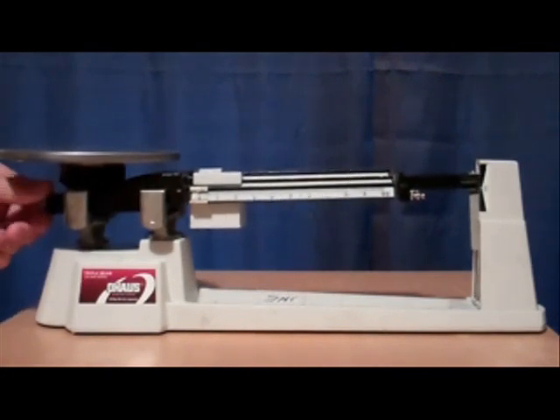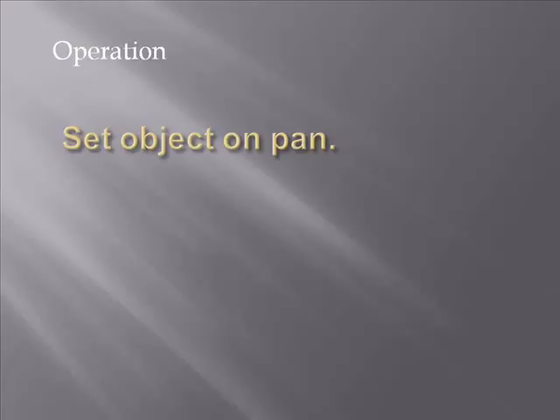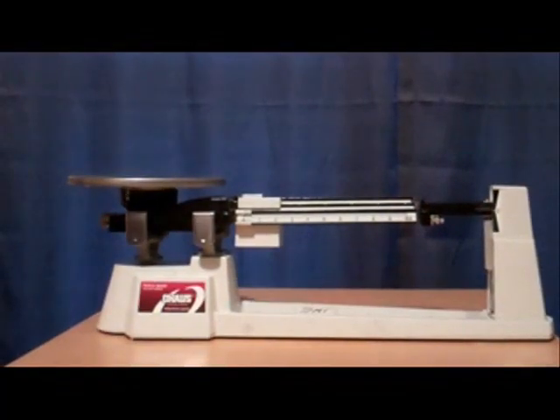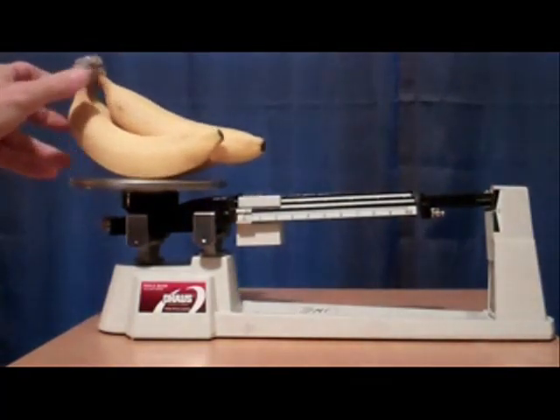Now the triple beam balance is ready for use. Set the object that you'd like to measure the mass of on the pan of the triple beam balance. I'd like to know the mass of these bananas.